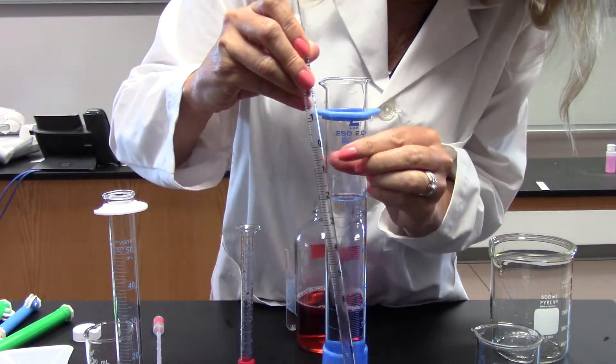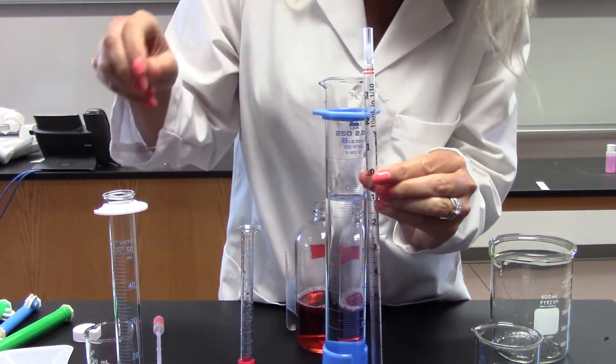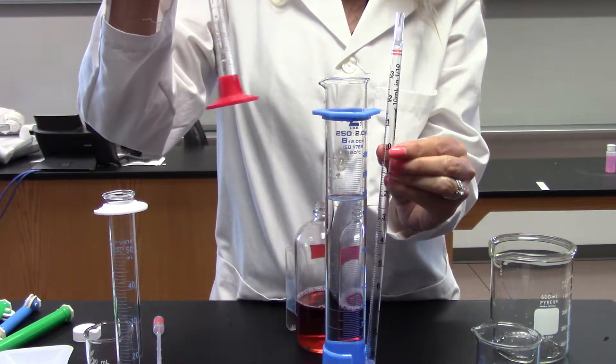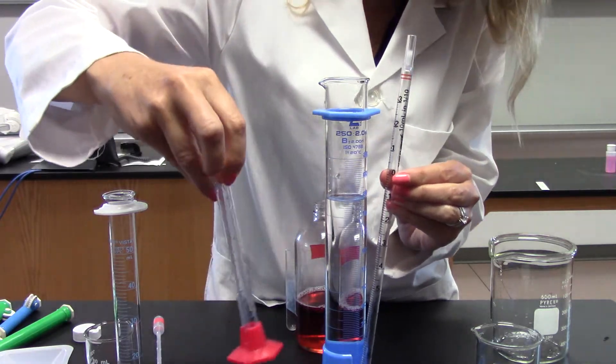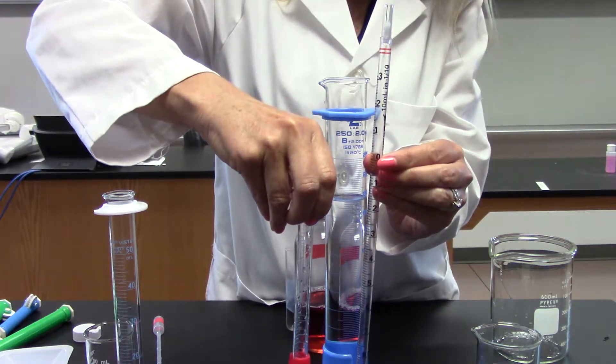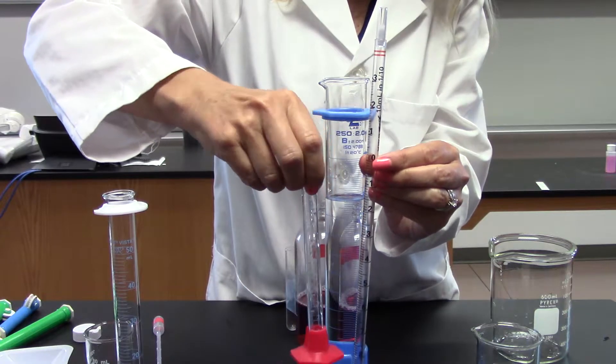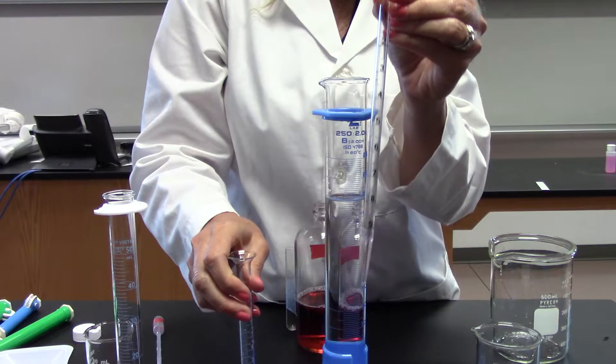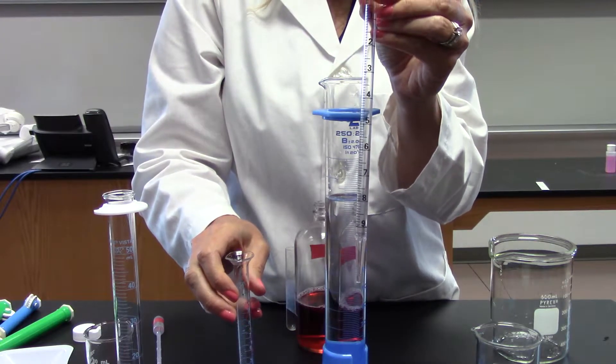Something else I want to point out - this is a 10 milliliter pipette with the zero at the top. This is a 10 milliliter graduated cylinder with the 10 at the top and zero at the bottom. The numbering is reversed. The reason for this is the pipette dispenses out the top and the graduated cylinder dispenses out the bottom.